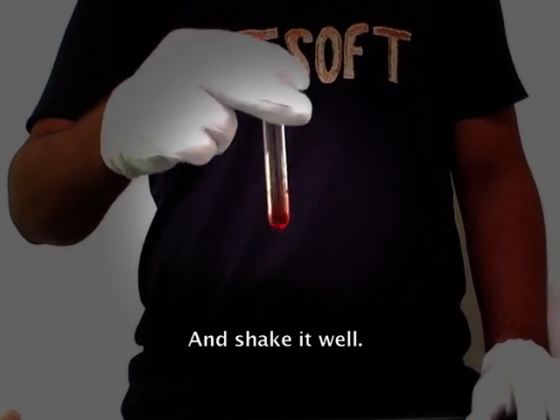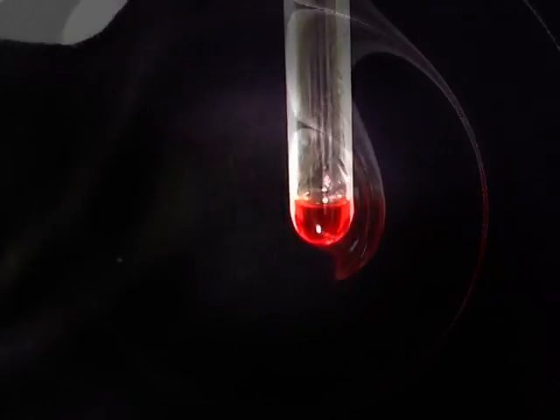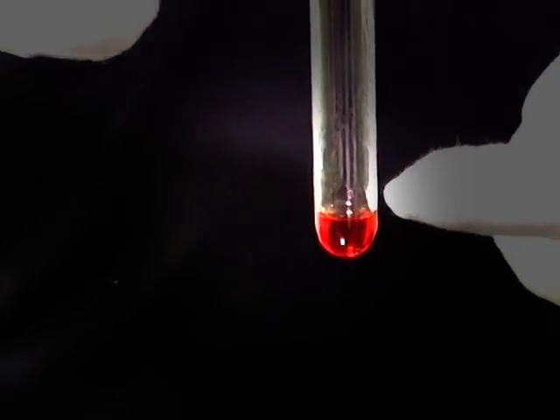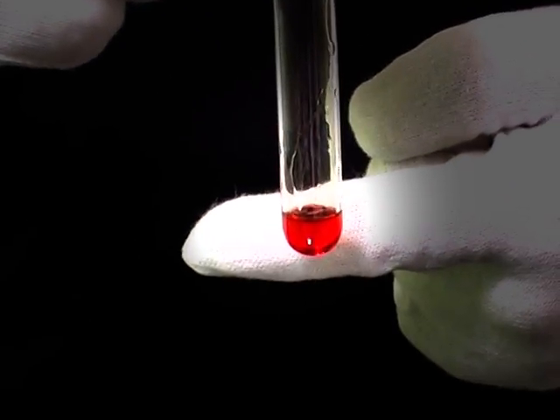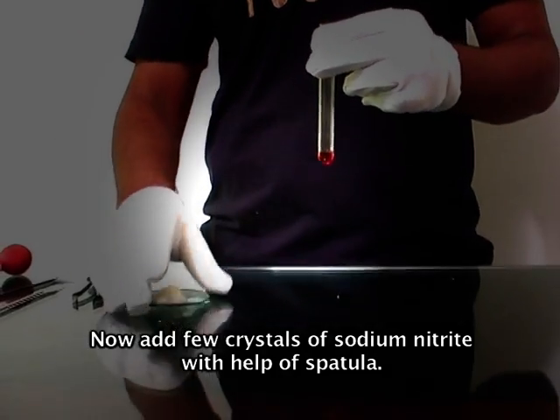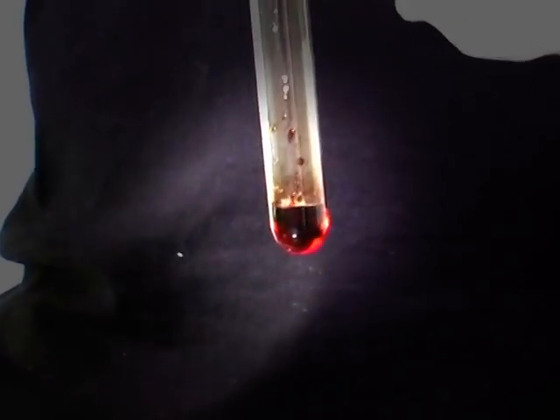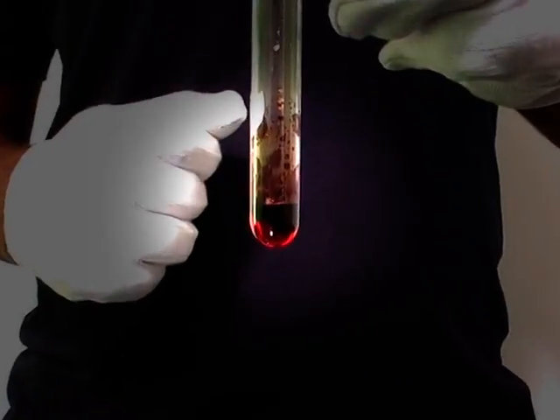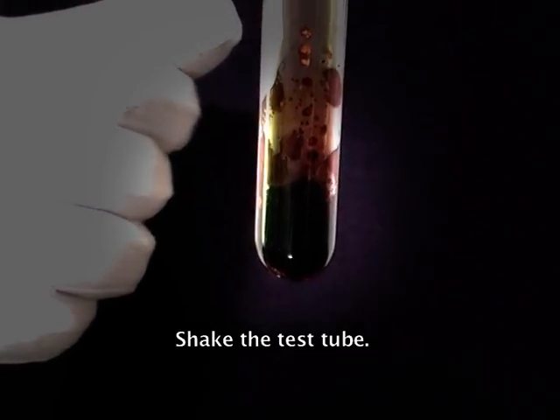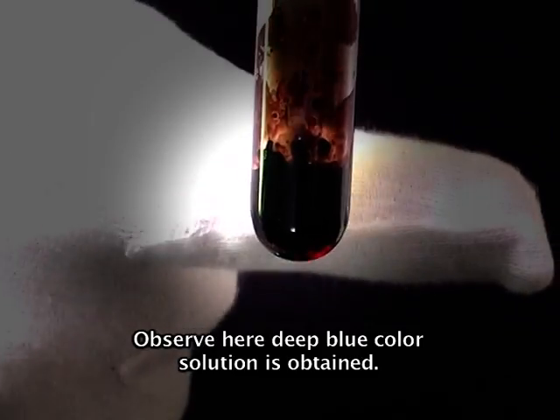Shake it well. Now it is red in color. Now add a few crystals of sodium nitrite with the help of a spatula. Shake the test tube. Observe here — a deep blue colored solution is obtained.